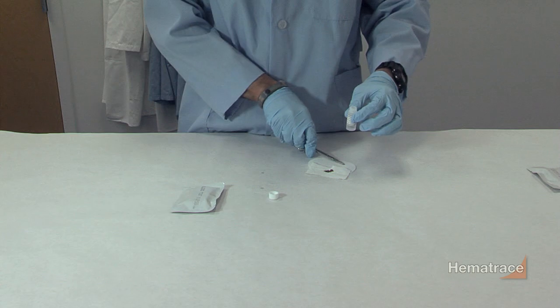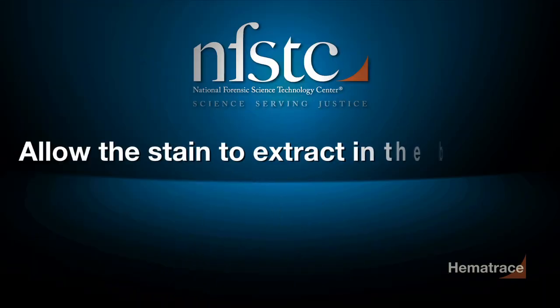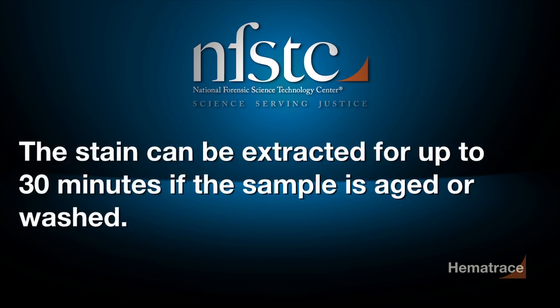Place the cutting in the vial with buffer provided in the kit. Allow the stain to extract in the buffer for at least five minutes. The stain can be extracted for up to 30 minutes if the sample is aged or washed.